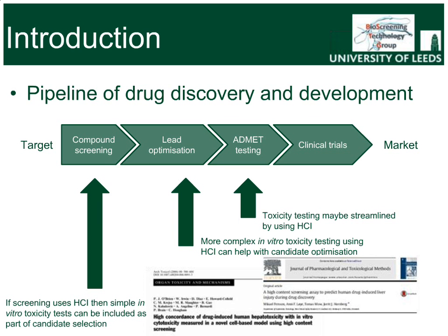These assess a number of endpoints, including membrane integrity and mitochondrial health, and compared the ability of these platforms to detect known hepatotoxins when compared to the conventional cytotoxicity tests. Indeed, the high-content approaches used had over 90% specificity and sensitivities of between 50 and 90%, depending on the endpoint assessed. So the utility of high-content imaging for the detection of cytotoxicity has been established.